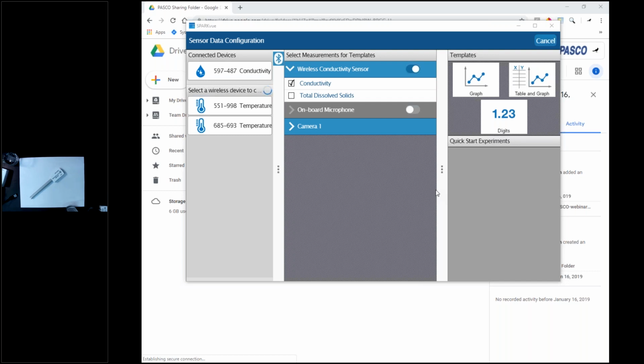If you're saving with an iPad, you would have to do what's called sharing. I don't have an iPad to show you, but I can point you to a video resource on how to save in the iPad. Also, recently with smart devices, there's the ability to save to a cloud drive if it's connected and installed on your device. So if you use Google Drive, you can save there, and that's true for any device where it's installed.